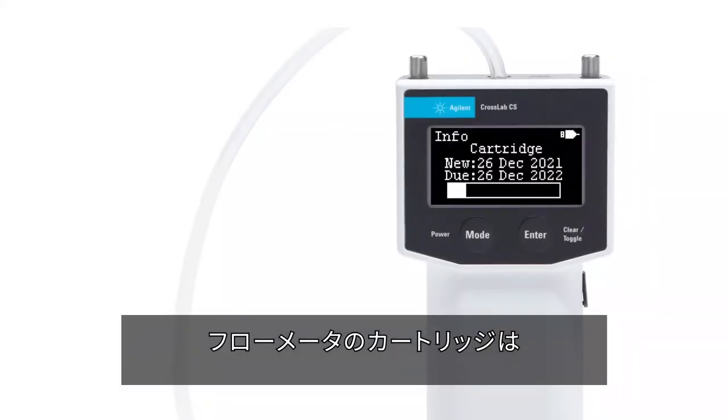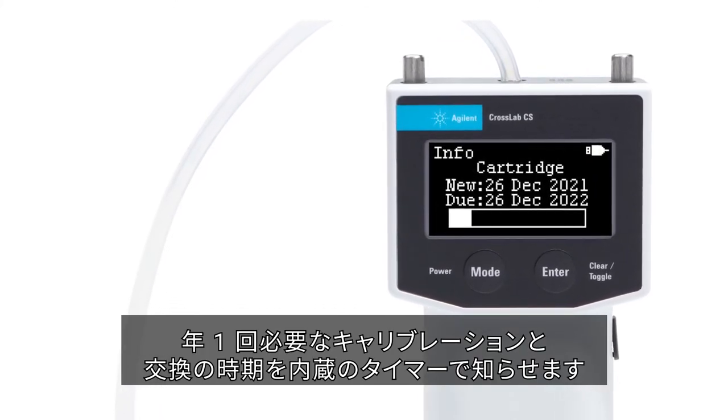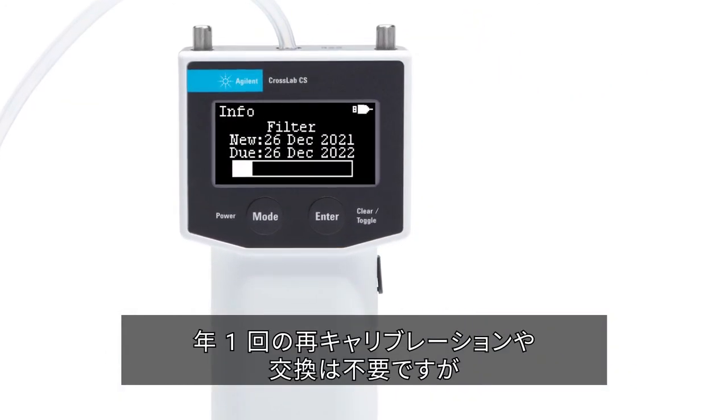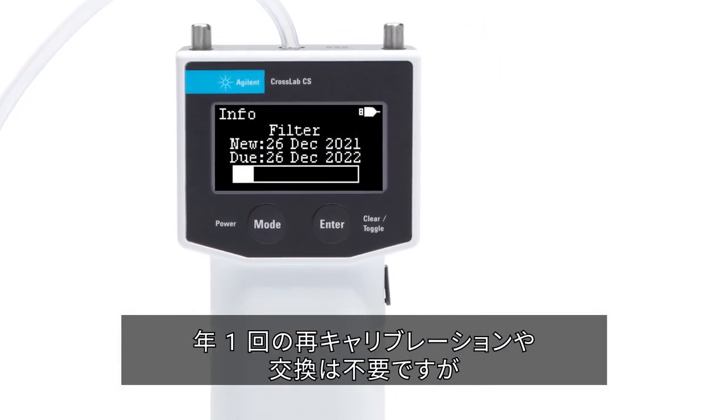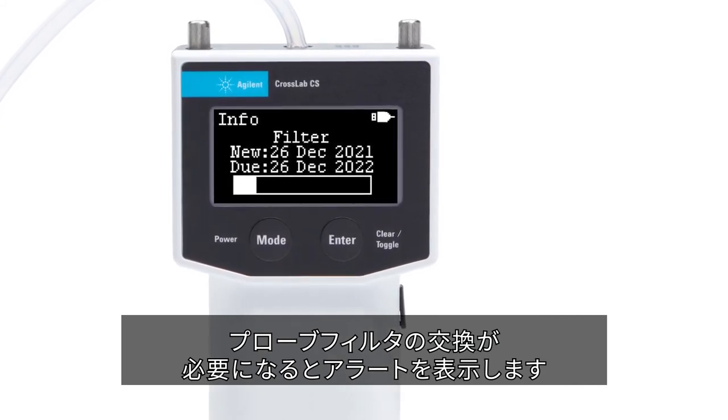The flow meter cartridge will track when it needs to be calibrated and replaced annually with a built-in timer. The leak detector cartridge does not need to be recalibrated or replaced annually, but will alert the user when a probe filter needs to be replaced.